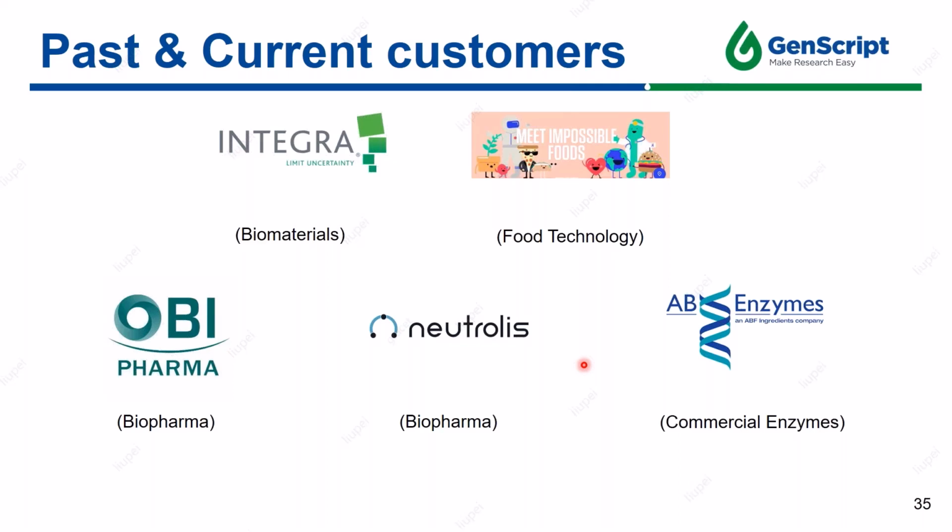We produce the antibodies from the plasma cells of mouse and rabbit, not from the human. But we can do chimeric antibodies. We can make humanized antibodies by using the recombinant method.